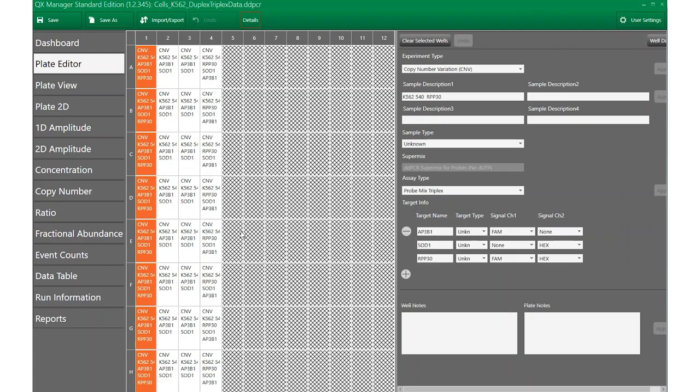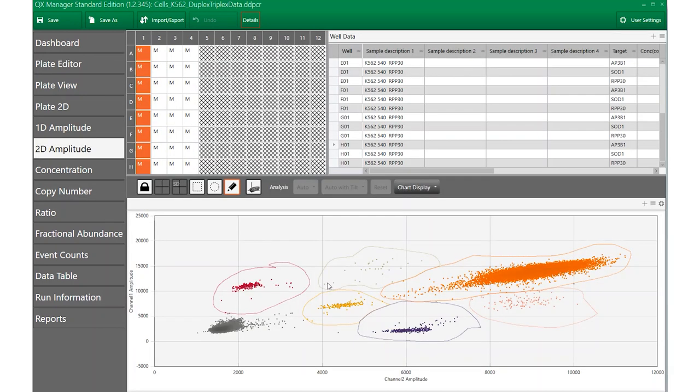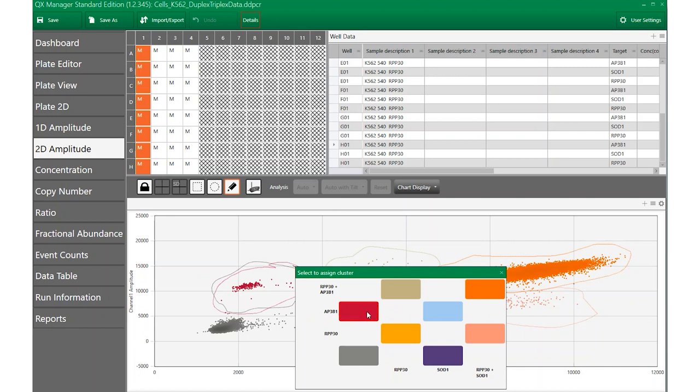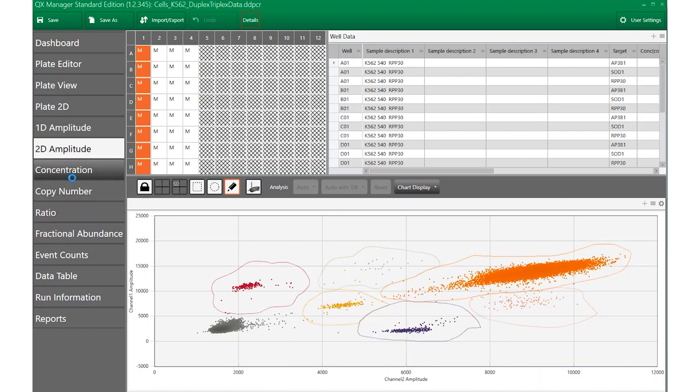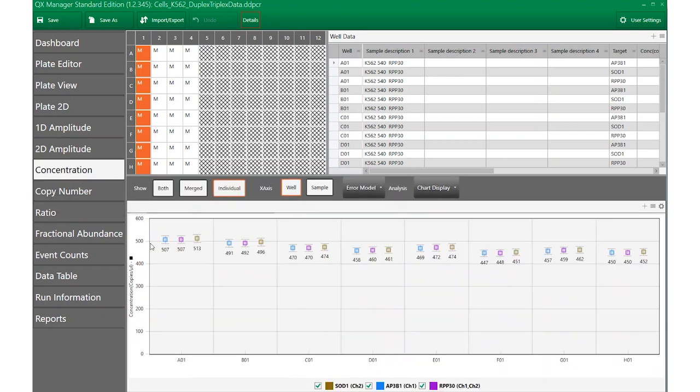Analyze the data using Qantasoft software version 1.7, Qantasoft Analysis Pro software, or QXManager software. QXManager software may be used for the triplexing method. After carefully labeling the wells, set the thresholds. The reported concentrations in copies per microliter from the software are directly equivalent to cells per microliter when performing the whole cell DNA workflow.